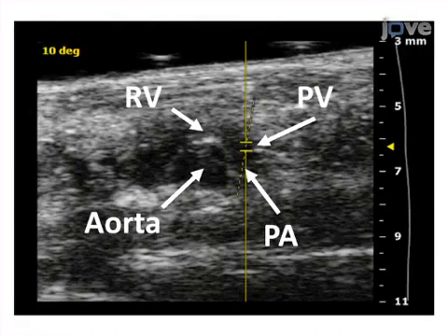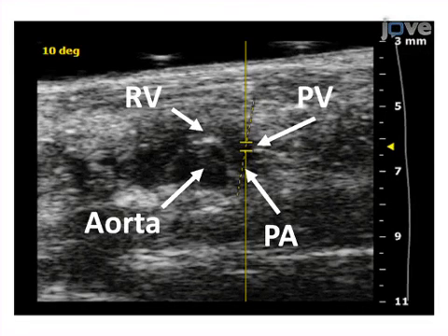Ultimately, the function of the transplanted heart and blood flow through the pulmonary valve can be monitored with a high-frequency ultrasound system in the pulse wave Doppler mode.